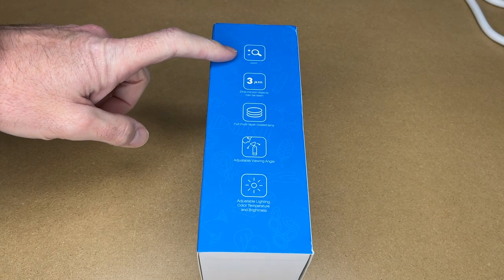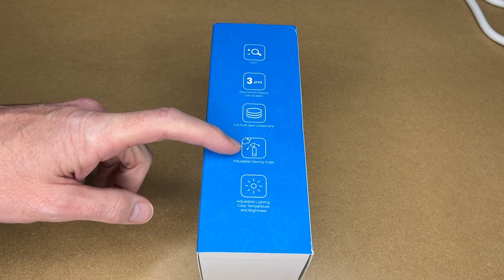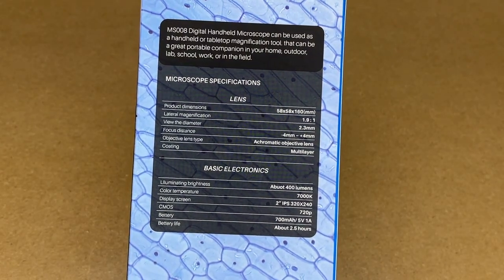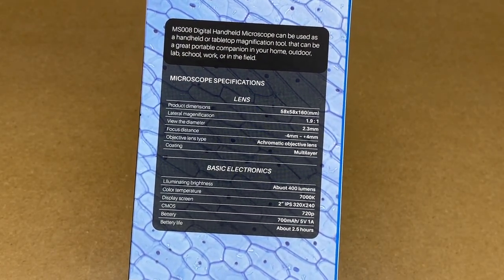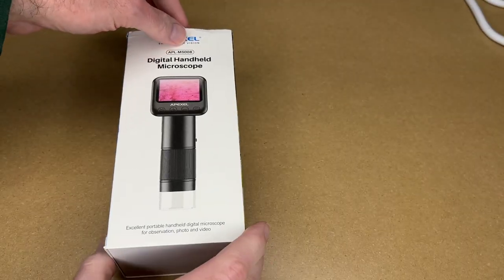If we look at the side it says it has zoom, one micron objects can be seen, full multi-layer coated lens, adjustable viewing angle, adjustable lighting, color temperature, and brightness. On the back we have some specs you can read through. This has a 700 milliamp hour battery and battery life is about 2.5 hours. So let's get this open.